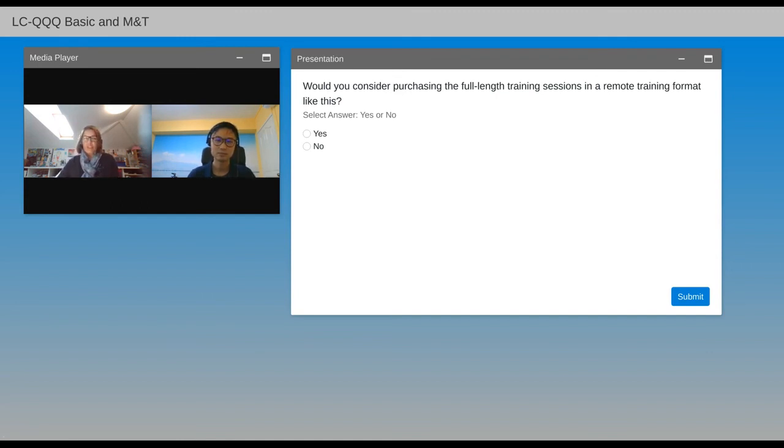We have a second question. Given that the G6495C is selling now, what are the key advantages as compared to the B or A series? Right. This is a very interesting one.